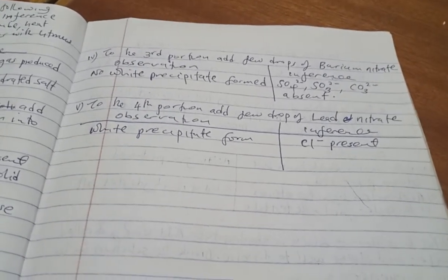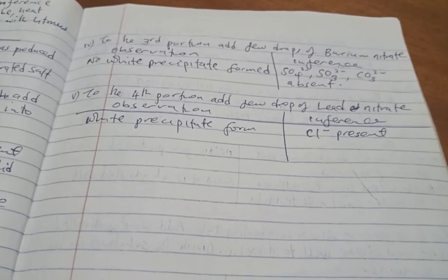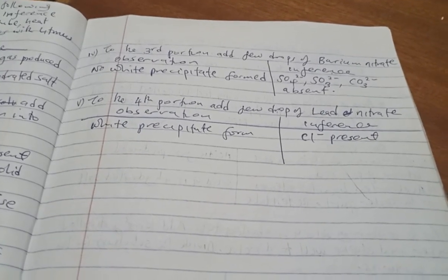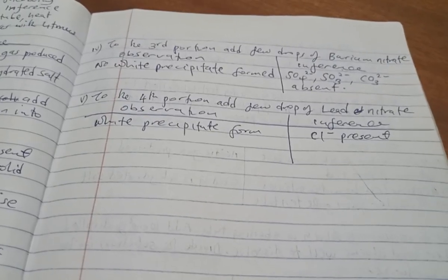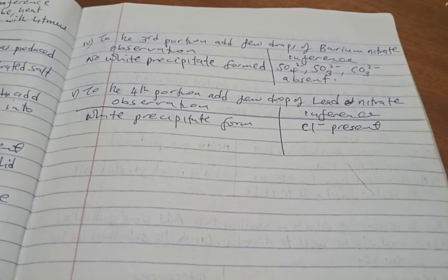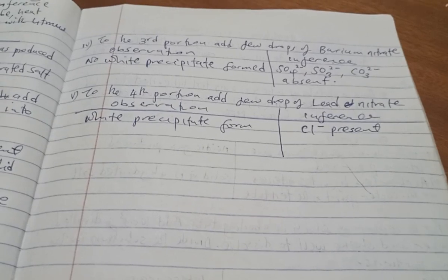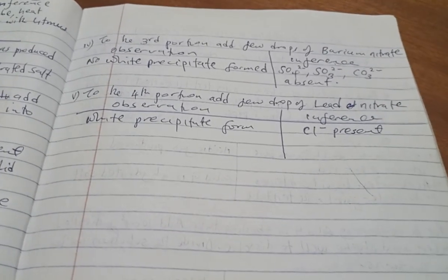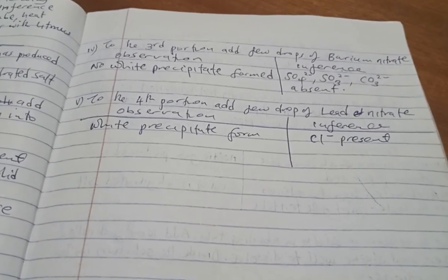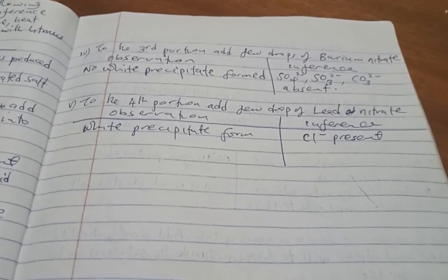So you can be told to add lead nitrate. When they ask you to add lead nitrate, then we are testing chloride ion or iodide ion. If you see a yellow precipitate, then iodide ion present. If you see a white precipitate, which I've given as an example in this case, then chloride ion is present. That is how we do that question. It is normally in question 2, but you just read your paper and you will see what is asked. Always do the practical. Thank you.